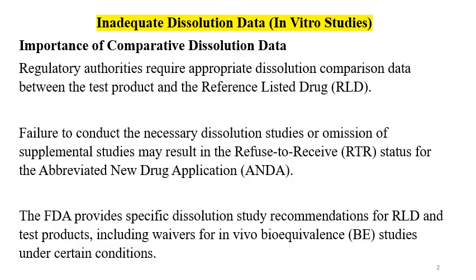So, what is the importance of dissolution? First of all, dissolution testing is an in vitro test to predict the in vivo behavior of the formulation. It is a product specific test. It is a requirement to release the batch into the market, and this test also gives you the required information on how the product will behave in vivo. So directly, dissolution testing is related to the safety and efficacy of the formulation.